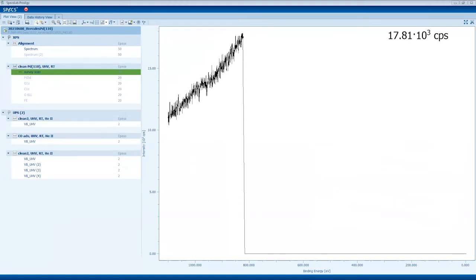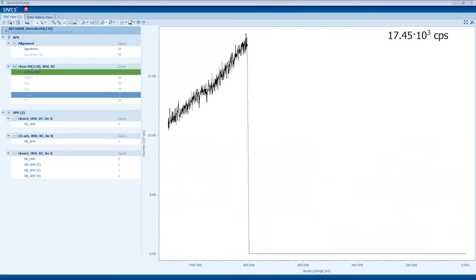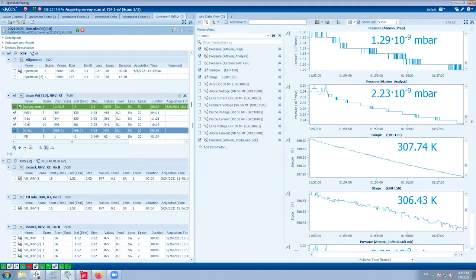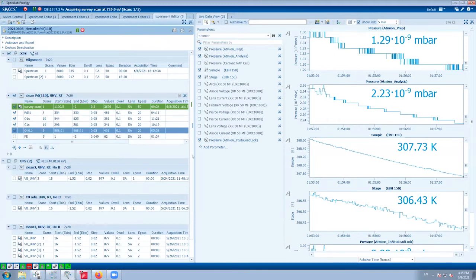I added kinetic energies because the oxygen peak and palladium 3P are overlapping, so it was not possible to follow oxygen normally. For this, I set the Auger peak of oxygen. So here we measure not only the oxygen 1s peak, but also the oxygen Auger peak.